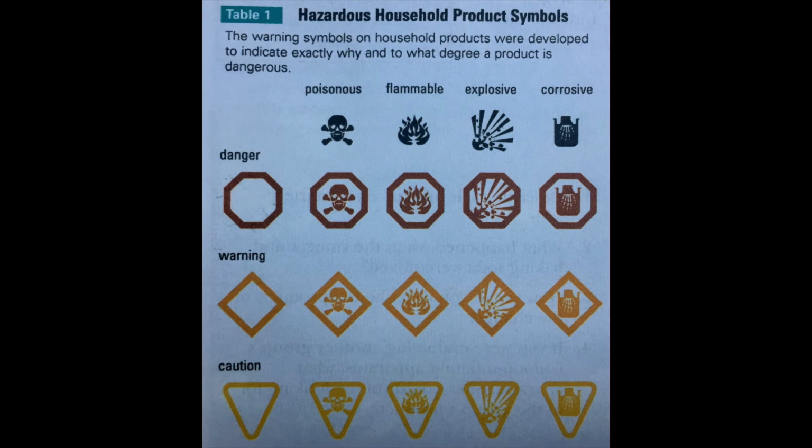But no experiment is going to be performed with unsafe chemicals, unsafe procedures, unsafe equipment. However, it is still important for the student to understand that they must do precisely what they are supposed to do and nothing else, and act accordingly.